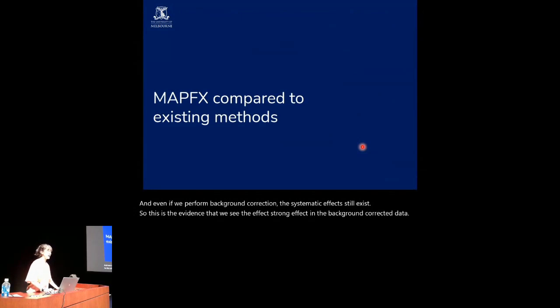So in terms of analysis pipelines, our method is called MAPFX, and there are 2 other alternative pipelines.